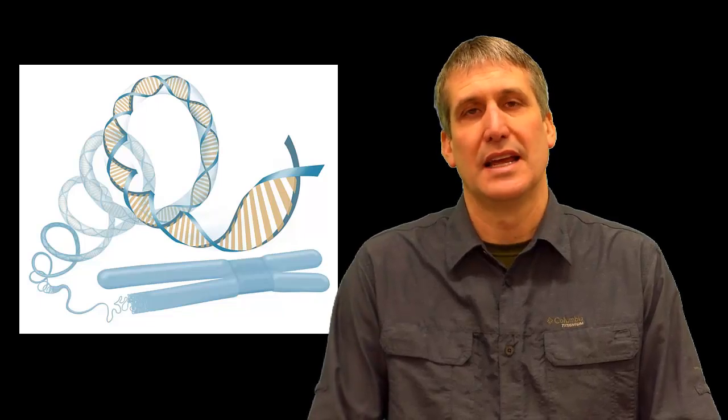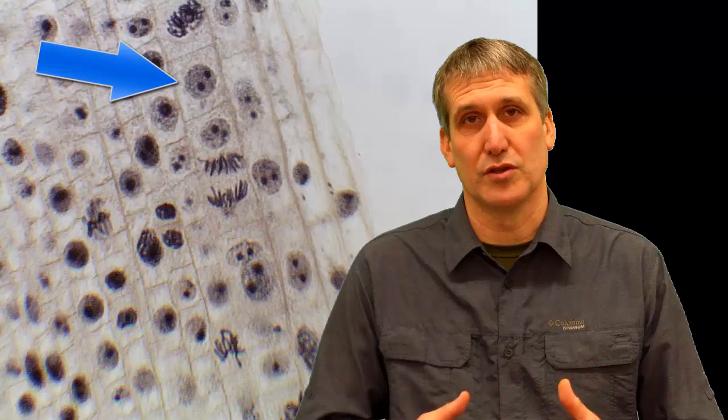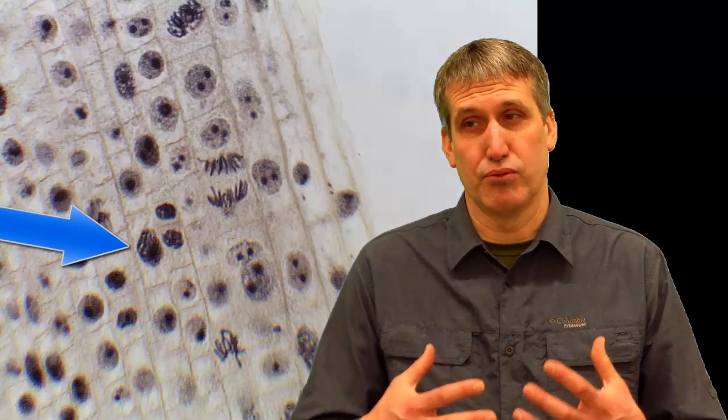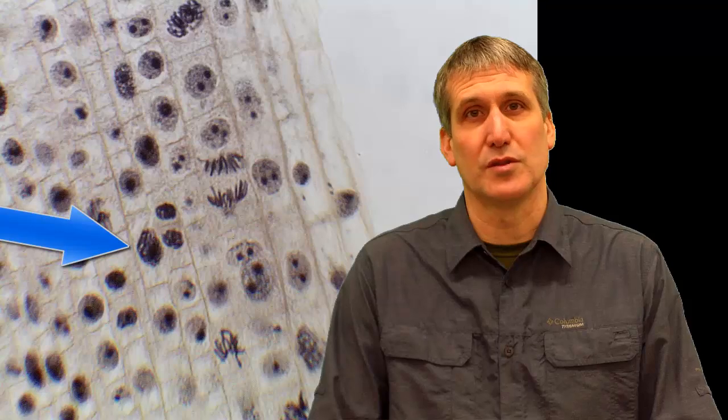So you can look at each cell and ask yourself, is that cell in interphase? Have the chromosomes condensed yet? Is that cell in prophase? Can I see the chromosomes but are they still kind of in a circular pattern like they just condensed?